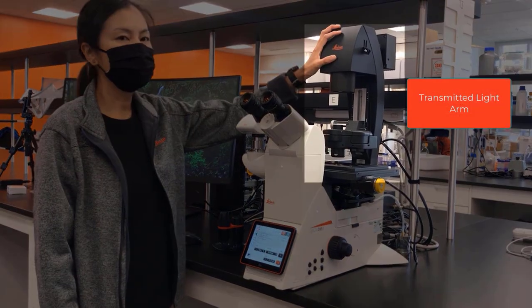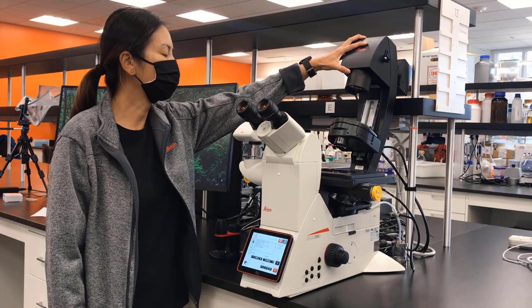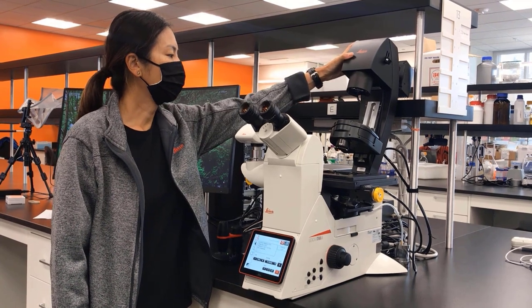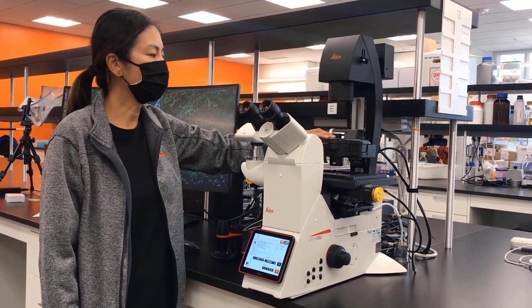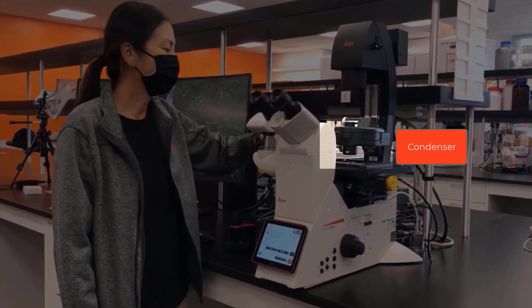Starting with the top, we have the transmitted light arm. We can push the transmitted light arm back to better access our sample holder and stage area. Going down the microscope, we have the condenser. We'll go over Kohler alignment in another video later.